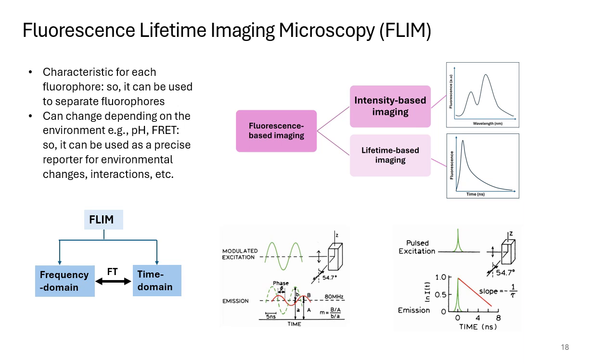So it leads us to some difficulties. On the other hand, we know that fluorescence lifetime is only a property of the molecules, which is characteristic or particular for each fluorophore. So it is more convenient to use fluorescence lifetime for imaging.